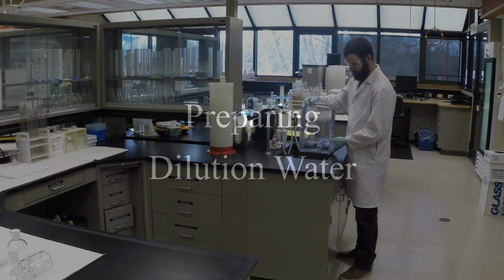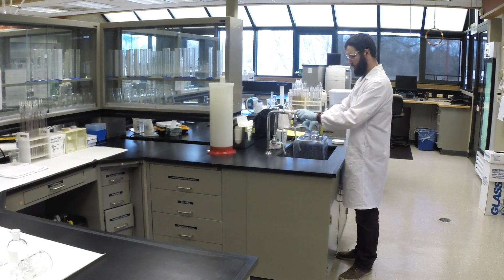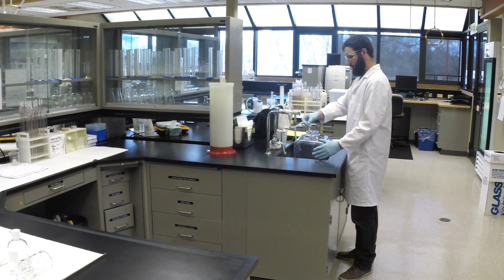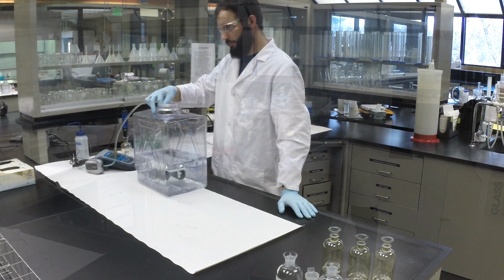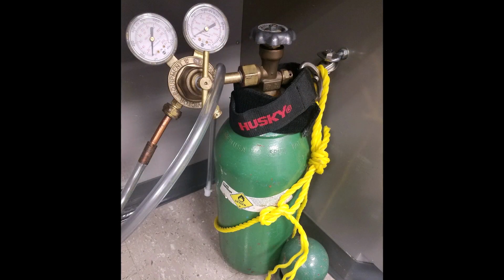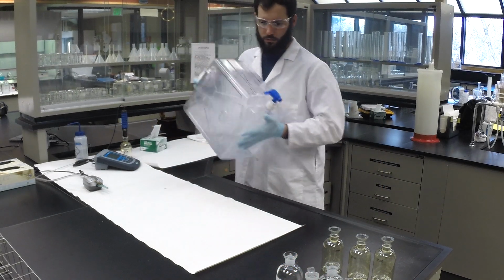Preparing dilution water. Dilution water needs to be nutrient and microbial-free water and have enough oxygen present for microbial consumption. As long as you use one of the previously mentioned sources of water, the water should have few microorganisms or nutrients. There are a few different ways to ensure your dilution water has enough oxygen. We recommend filling your carboy with enough water to run your BOD test 1 to 3 days prior to your initial setup. You can aerate with a basic aeration pump. You can aerate with an oxygen tank. You can aerate with vigorous shaking.